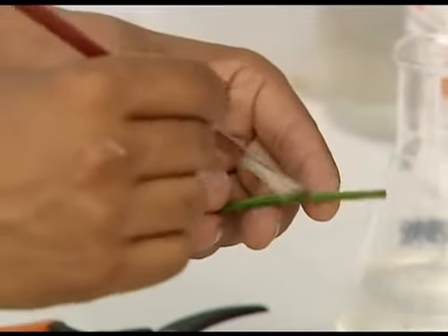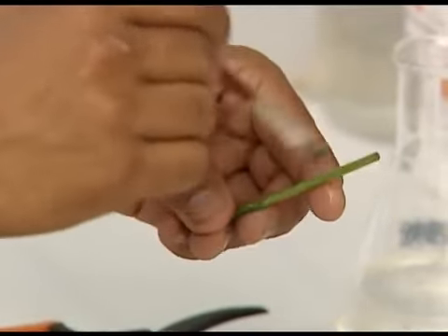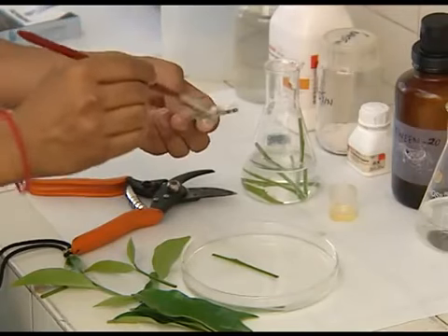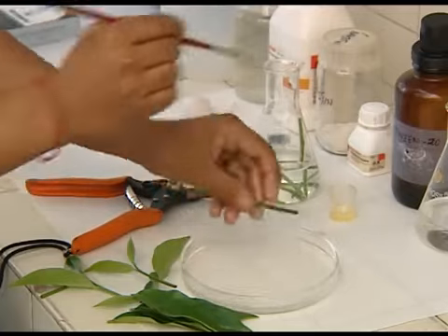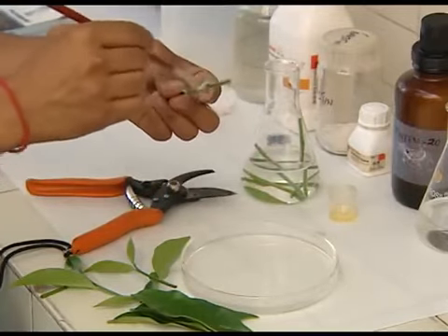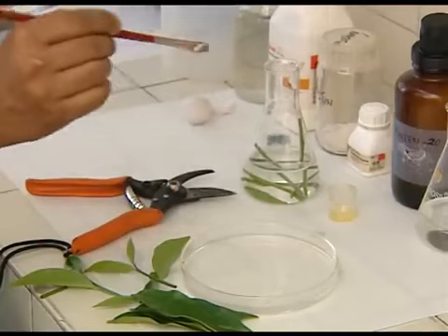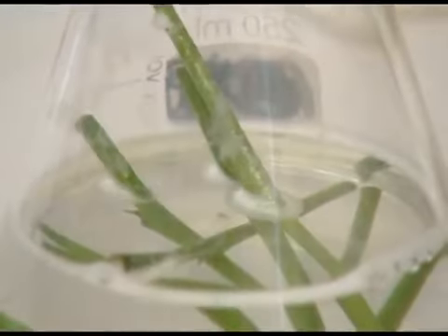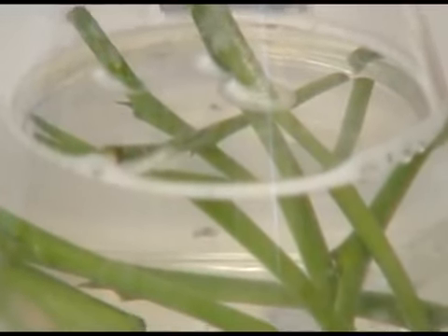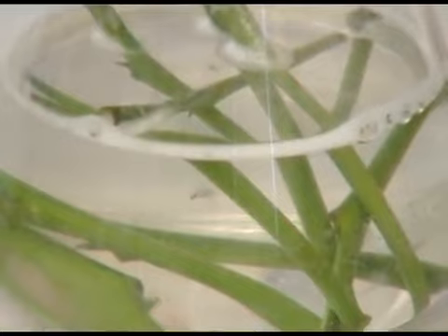The surface of the explants is then brushed clean with a mild detergent such as Tween 20 as a wetting agent with a sable hair brush. After cleaning the surface, the explants are picked up and dropped into a glass or plastic vessel containing a mild solution of a fungicide or an antibiotic.